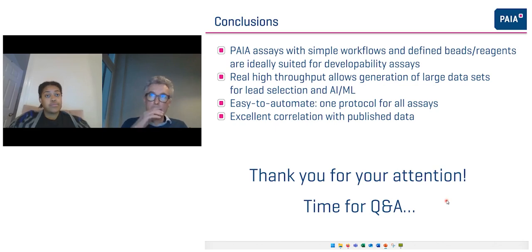Yeah, I mean, we are always looking to add new assays in the future. Of course, we would like to have something which is going into the direction of self-association. This is something that we can't do yet, but we're thinking about it, of course. And then, of course, FcRn would be a huge thing. So stay tuned. We're working on these topics.